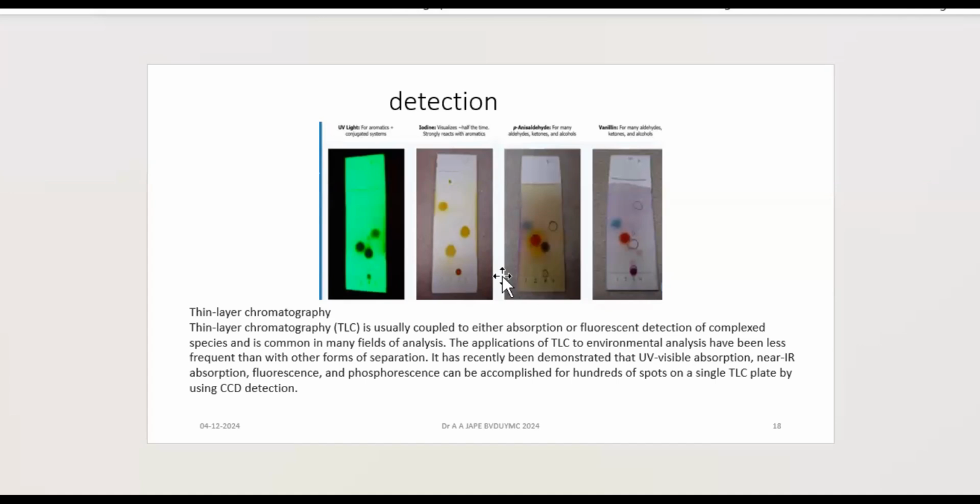Now, another important thing to be talked about is the movement of compounds on TLC, which may be characterized not just by observation. I'm talking about characterization, and that is with the help of the RF value. In the previous slides, we talked about the retention factor, the RF value, which is a measurement. Of course, as I said earlier, it is going to change for one analyte depending upon the solvent system chosen.